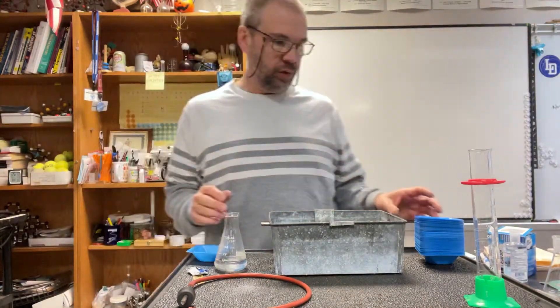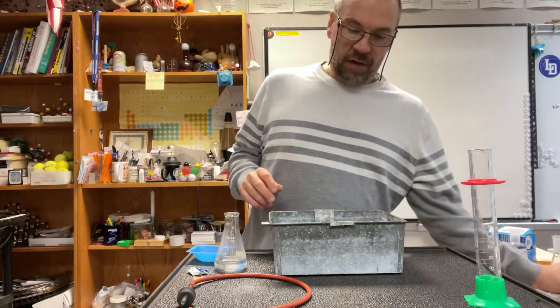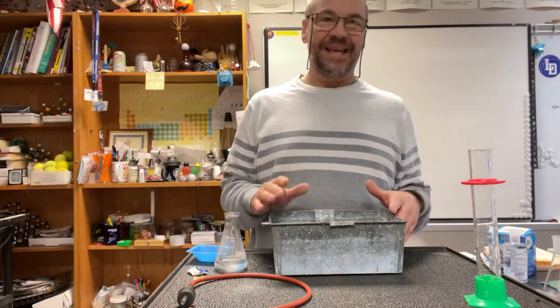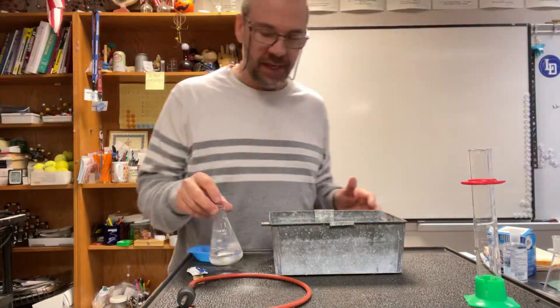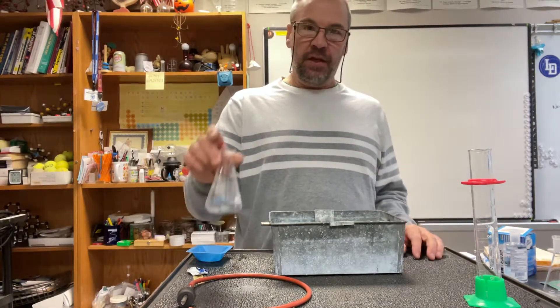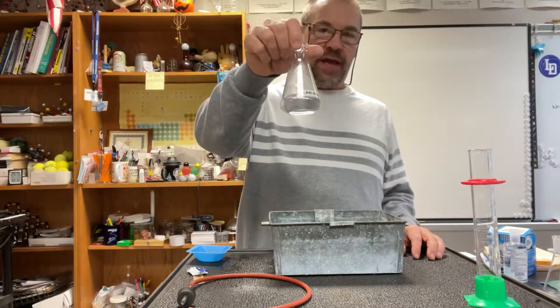All right folks, let's talk about what you are going to do in this lab. First of all, you have what we call a gas collection apparatus, and the way this works is you have a vessel that you're going to do the reaction in.